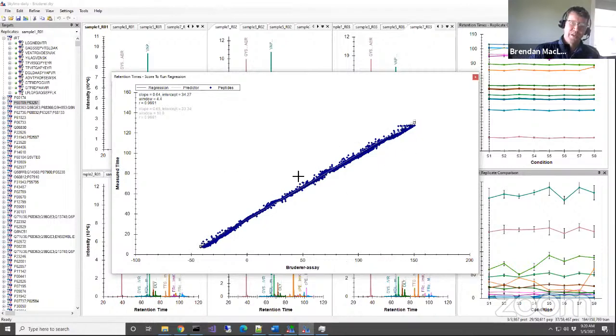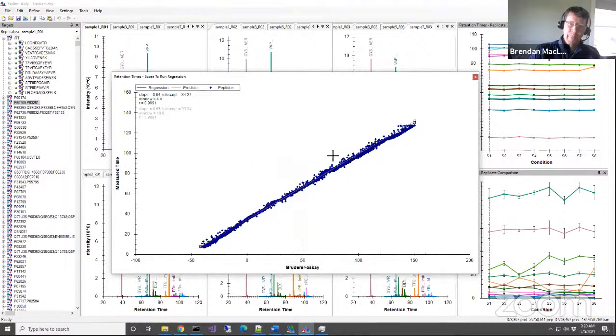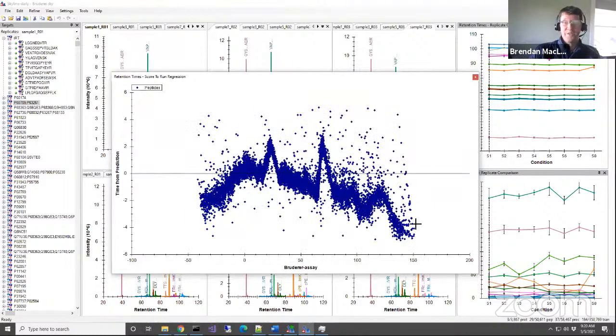And we can see some jogging around and stuff. So it's often very interesting to switch to a plot, which is the residual plot. That's just showing that. Wow, the chromatography of the system used to collect the IRTs is clearly pretty different from the chromatography of the system used to collect the DIA. But this speaks to the question yesterday.